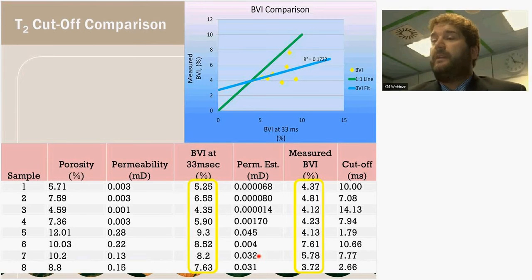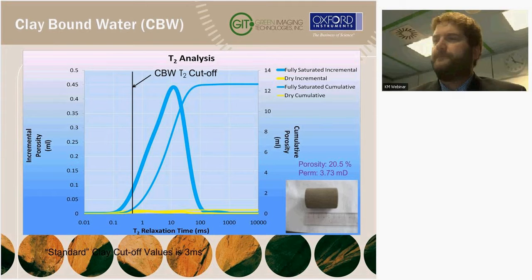laboratory measurements. As part of the process, we'll measure the permeability of each of these samples, and we'll derive those other permeability coefficients as well. I'll mention this because historically people have said that we don't see clays in these T2 measurements, and that's certainly been true. Based on equipment limitations, we really haven't seen the clay-bound fluid.